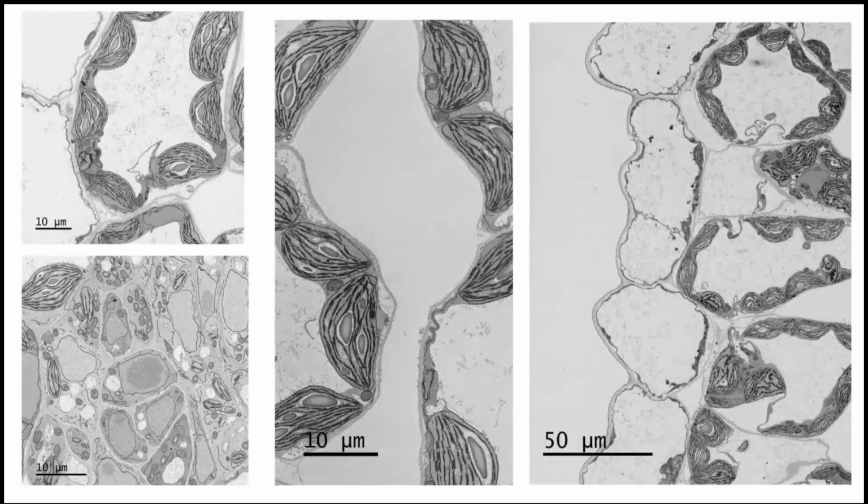As you can see, we've got some lovely contrast here. The protocol seemed to work beautifully, and I was very, very pleased with this. For those that aren't familiar with plant science, these are just images of cells, and these large spaces in between are the large vacuoles that I was speaking about. We have the chloroplasts inside and the starch grains inside. These are the main things that we want to see. So this shows great fixation. The cells are bound to the cell wall, everything's contrasted lovely.